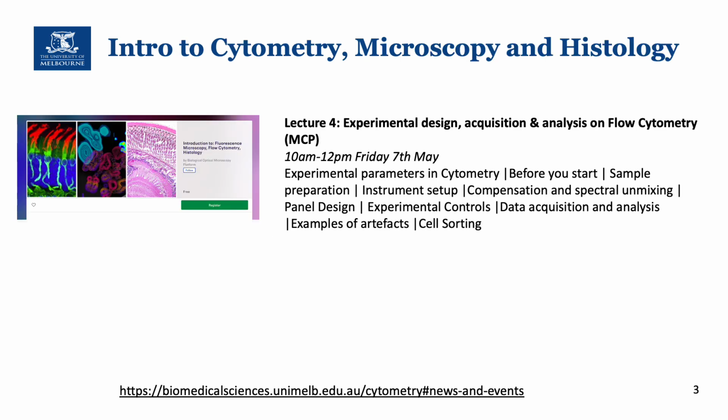Now, the second lecture will be on Friday, and it will be a little more practical. So I will be talking about things including how to set up an experiment for cytometry, the information you need to know before you start, how you prepare your samples, how you set up the instrument, how compensation happens, and all the controls that you need for a proper compensation.